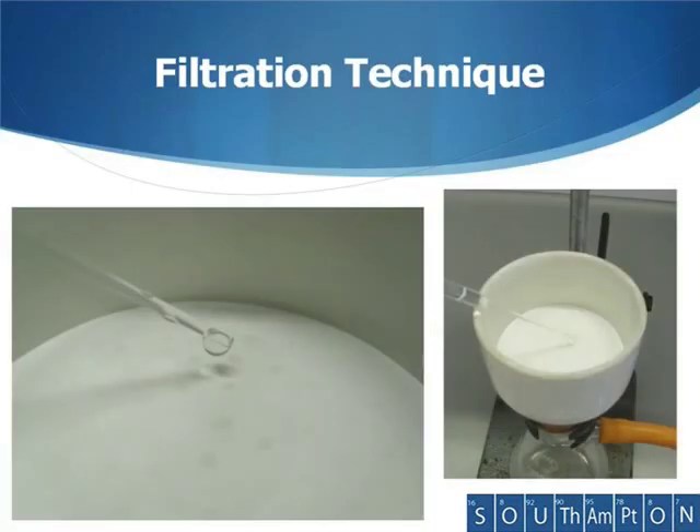Sometimes it's useful to damp down the filter paper in a Buckner funnel. You would normally do this using the same solvent as that which your product is suspended in. This will help the filter paper to stay in position so that your product doesn't go down the side of the filter paper and get sucked into the Buckner flask.